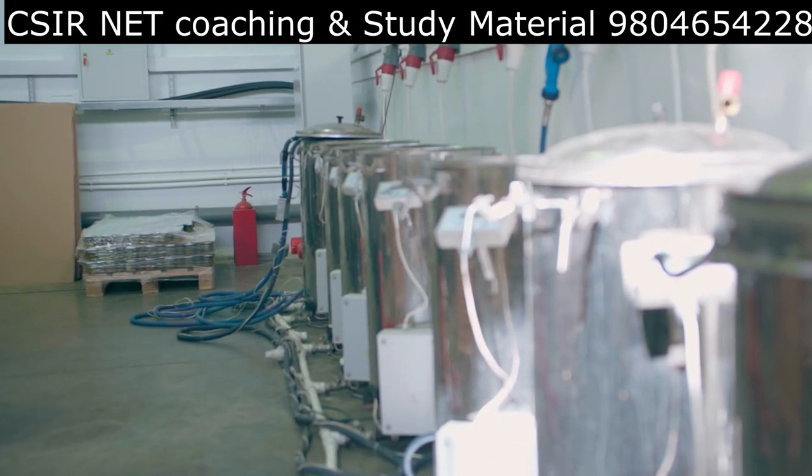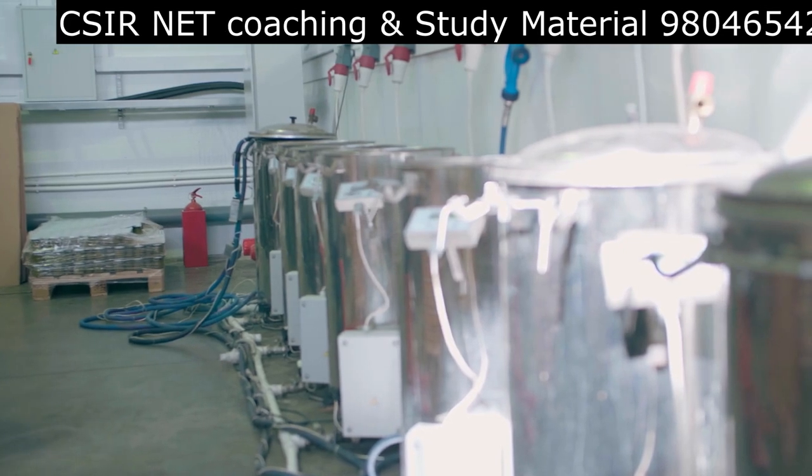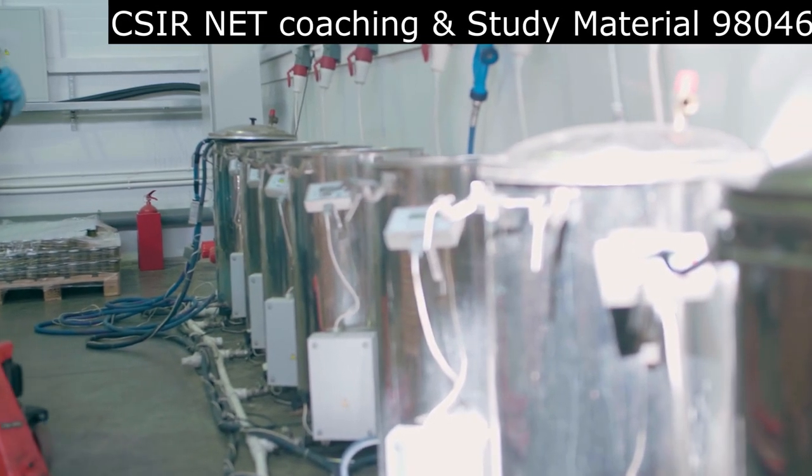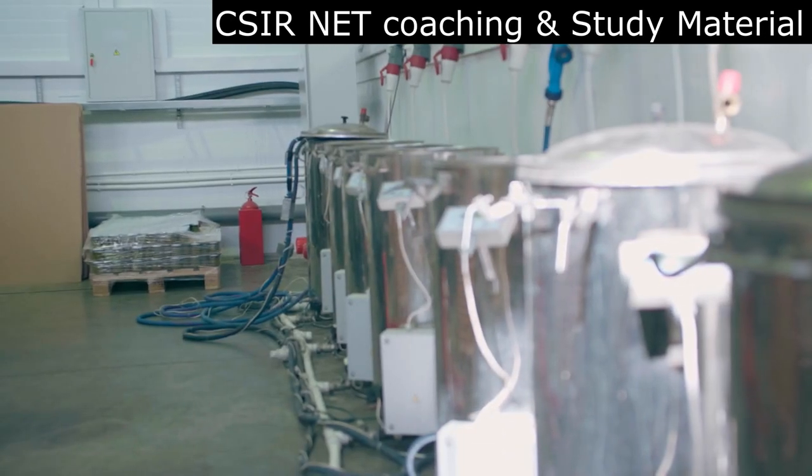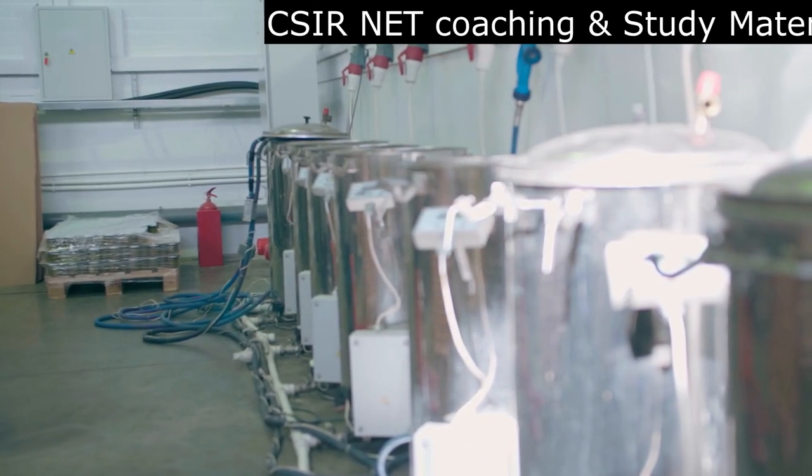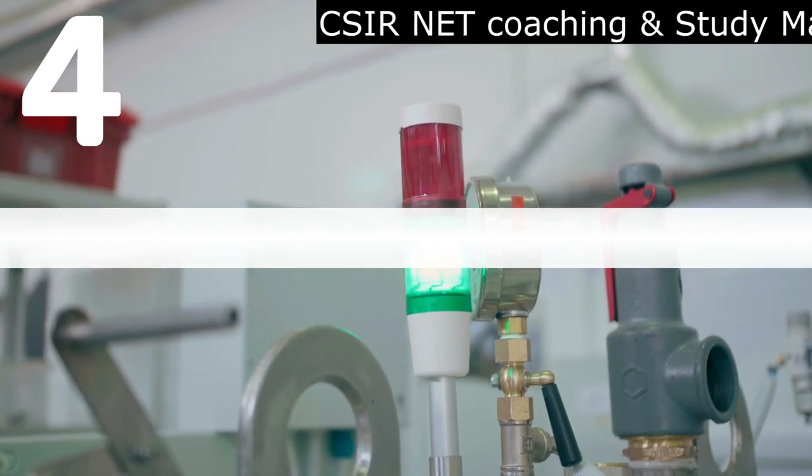The autoclave will begin to fill with water and heat up until it reaches the set temperature and pressure. The items inside the autoclave will also begin to heat up and undergo the process of sterilization.